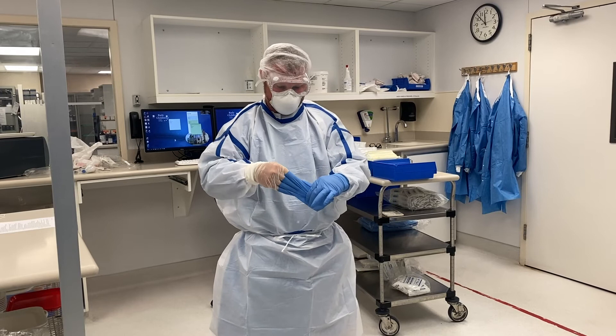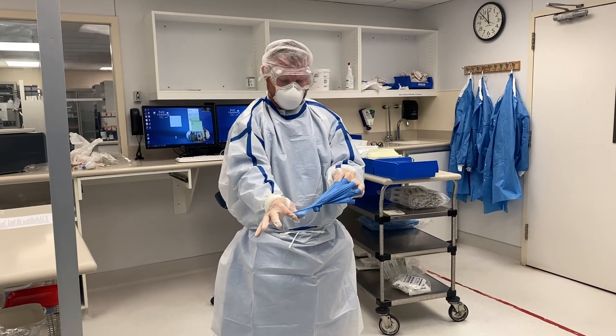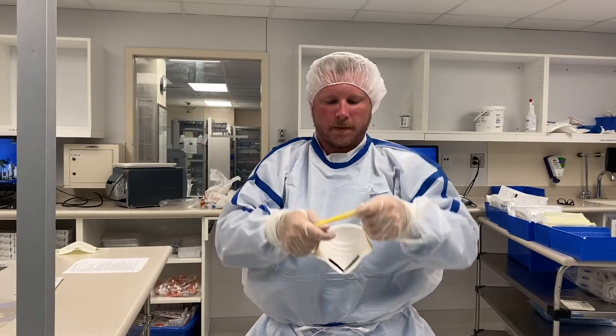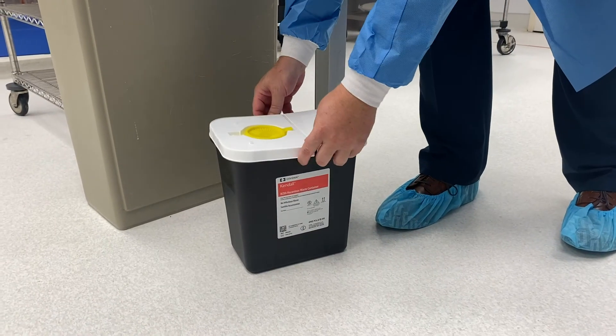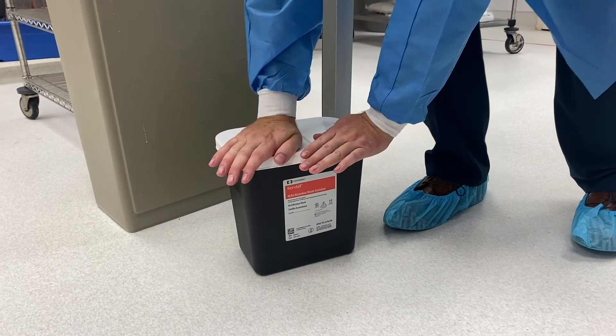When ready to remove your PPE, do so in the following order: outer pair of gloves, goggles, N95 mask or face shield, shoe covers, chemo gown, and lastly remove the second pair of gloves. Place everything in the black RCRA container, close the container lid firmly sealing the container, and identify the contents on the outside of the container per facility's P&Ps or SOPs.